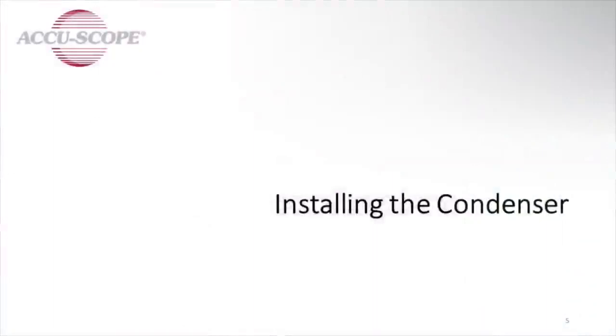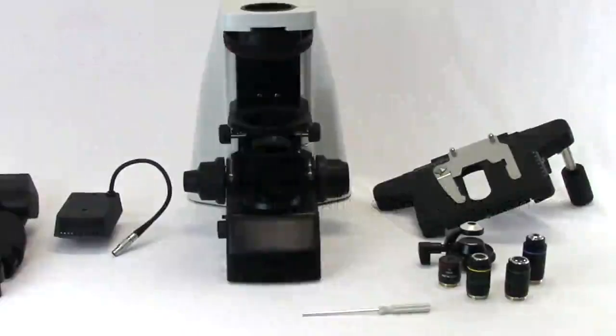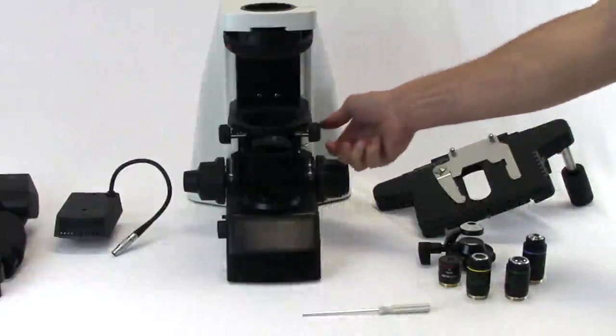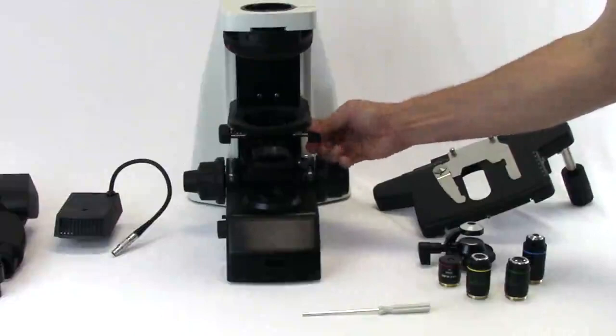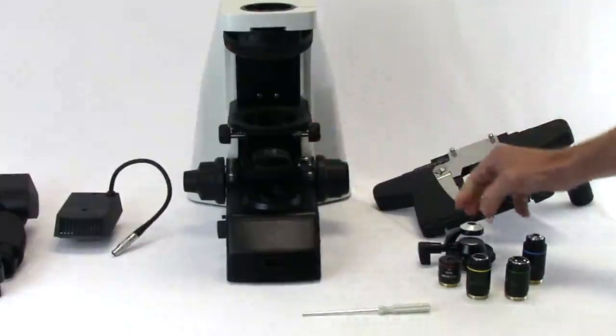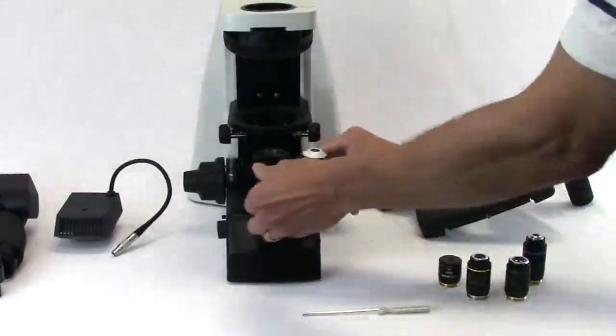Installing the condenser. Lower the condenser carrier to its lowest position by turning the condenser knob toward the front of the microscope. Loosen the condenser lock screw with the hex wrench.